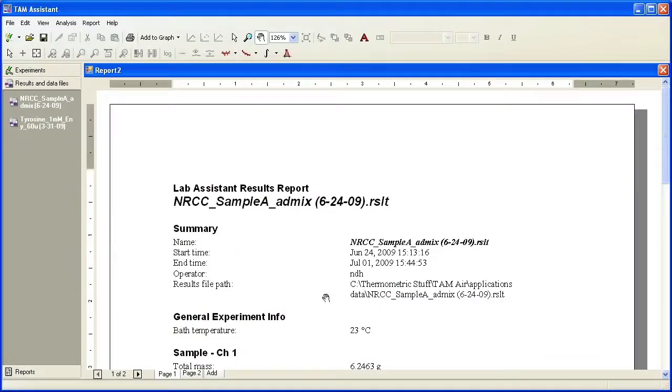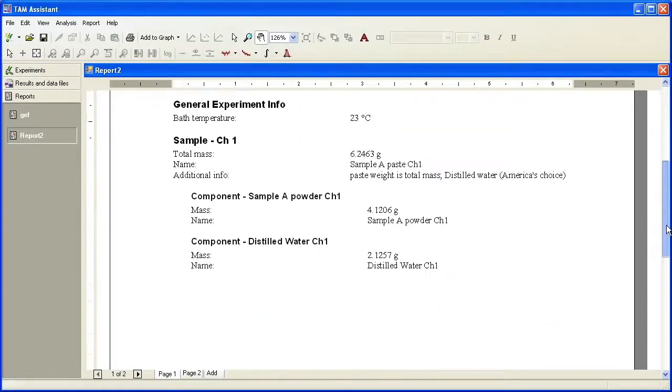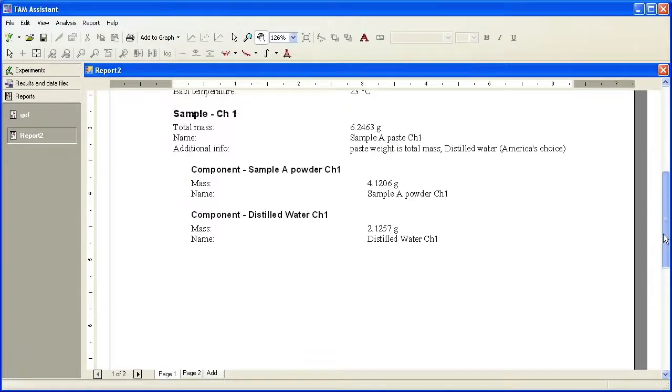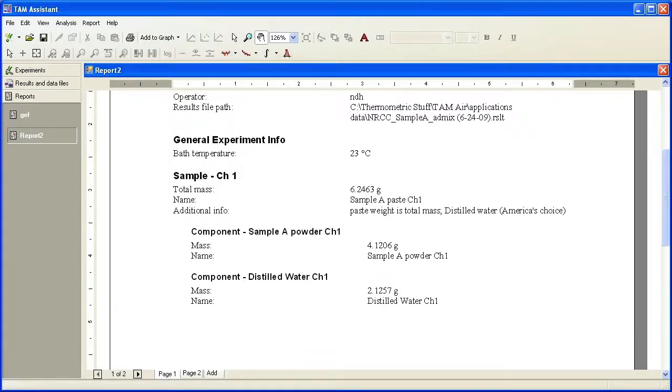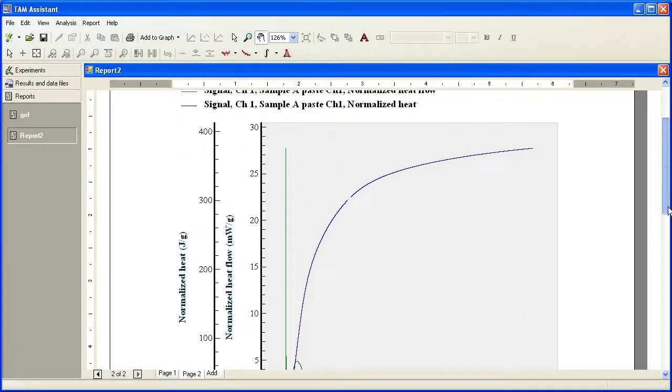You can see that the report is open. I have report number two here. It has all the sample information on page one, and if I click here on page two, it has the data plots.